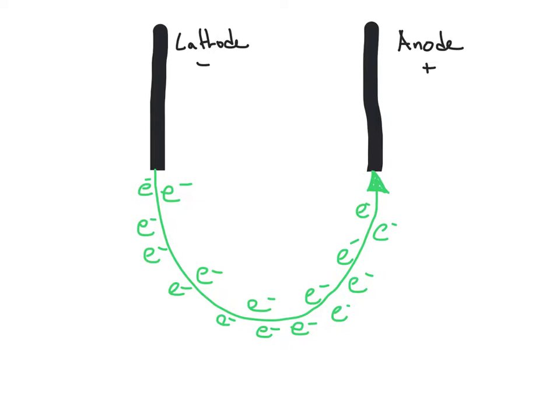This represents the setup that we were using, where we had the 2 pieces of graphite that were connected to the battery inserted into our solution. We had the cathode, which was our negative end, and the anode that was positive. Through the solution, what we can't see happening is that we have a flow of electrons moving from one end of the graphite to the other end, going through the solution, through the graphite, into the wire, and it's complete throughout the battery.